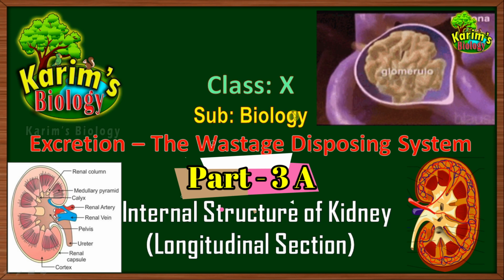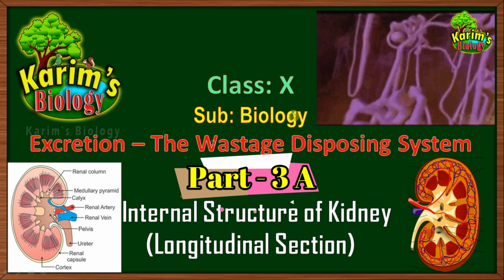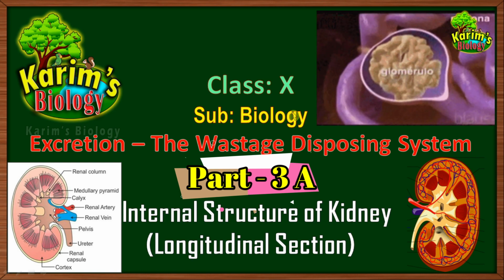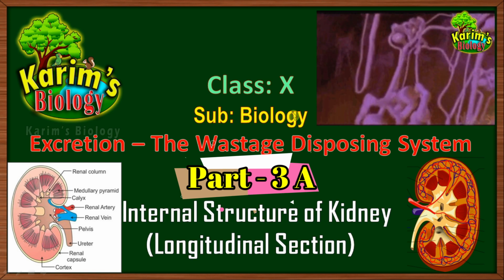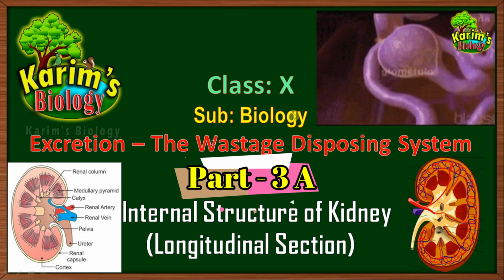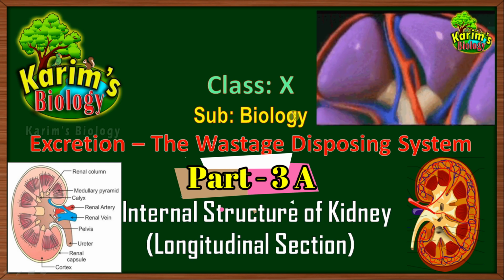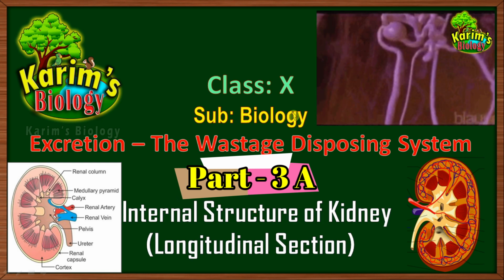In this series we have started the lesson Excretion, the waste disposing system, from class 10 biology. We already had two discussions, and today is part 3, session 3, in which we are going to learn about the internal structure of the kidney by taking the longitudinal section. This session is going to be very interesting because we are going to find out what is present within the kidney, the parts of a kidney. So let us start the session.